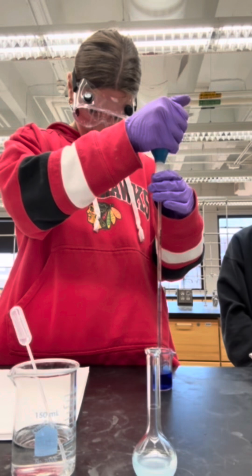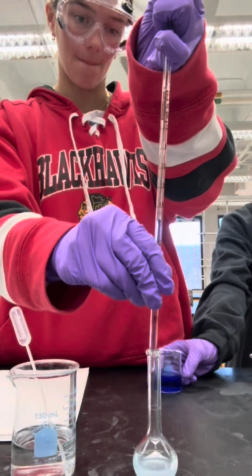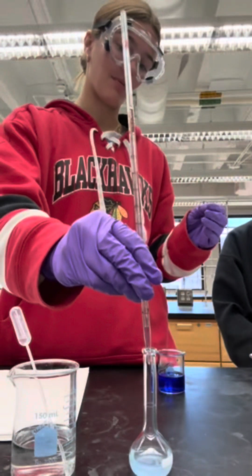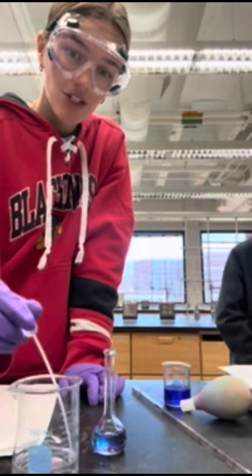Transfer the stock solution from the volumetric flask to a clean, dry, small beaker. To prepare the first dilution, transfer a small portion of the stock solution to the 25 ml volumetric flask and slowly add water to the mark. Add 10 drops of aqueous ammonia if the solution ever becomes cloudy.